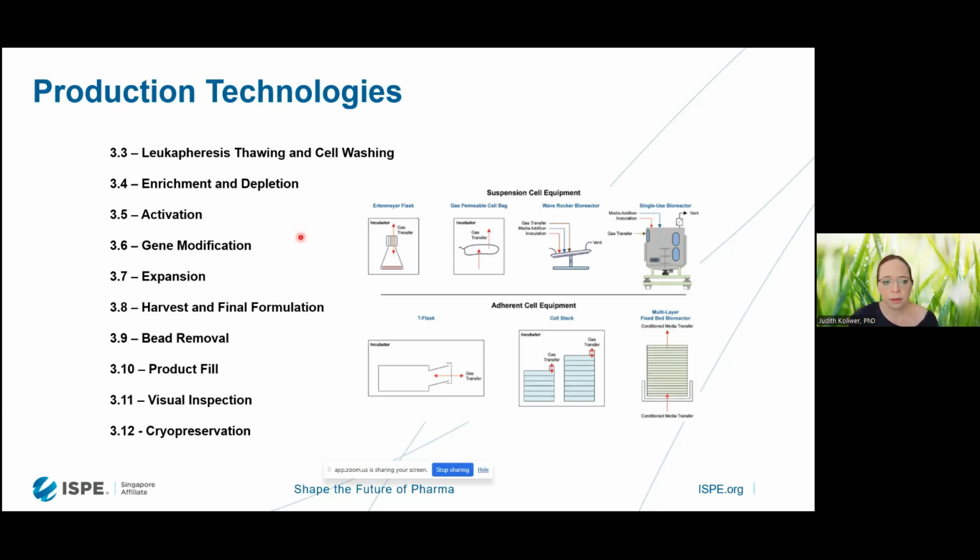And what we have seen here is that if we do that with a manual process, of course, it's very much about the SOP and the experienced operators who really know exactly how to do that to receive the best success rates.